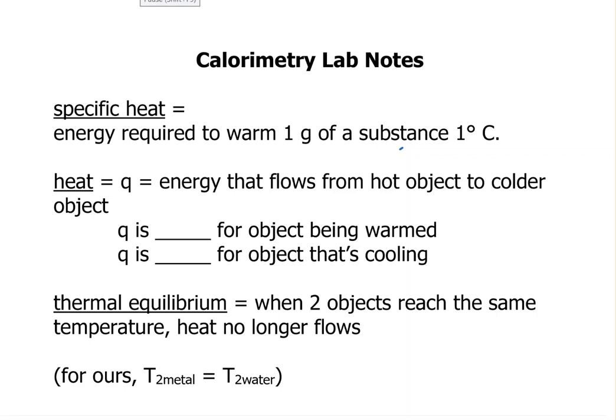Today's experiment in calorimetry, we're going to do two different parts. One is where we're going to look at a simple heat transfer from a hot metal to water, and in the other one we're going to look at a chemical reaction. And in both we'll look at the temperature change in the water and determine something about either the metal or the reaction. So some definitions here.